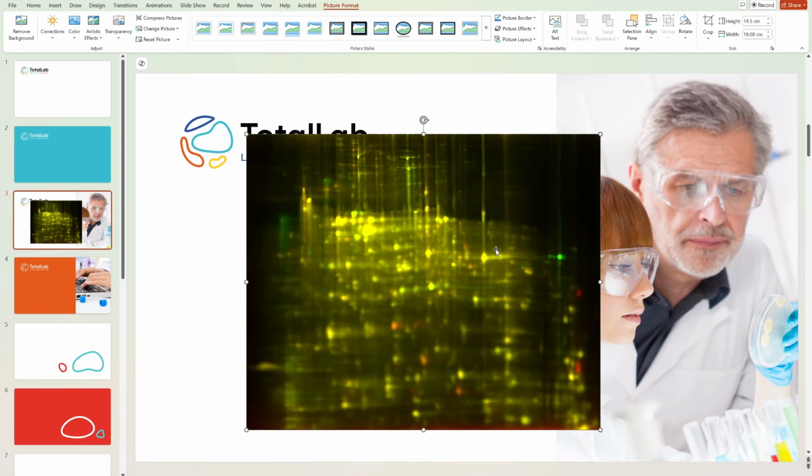What the software has done here is color one of your images in green and one of your images in red, and it allows you to see how well the two images overlay with each other. What I mean by that is we can see here this very bright green spot means there is a spot on only one channel of my image, which means there's a spot only on one of my images where there is not a spot in the other image, even after alignment. So this would obviously be marked as present on image 1, absent on image 2. This red spot and these red spots around here are the inverse. They are spots that are only present on channel 2, or only present on image 2, that don't have a matching or corresponding spot on image 1, so they're only red.